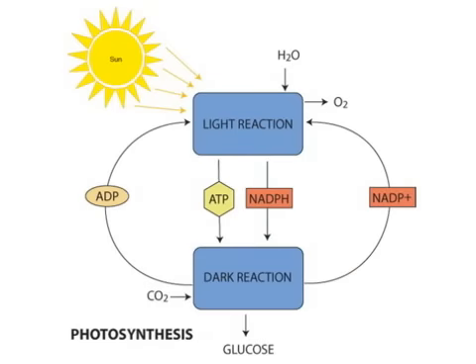Photosynthesis, as you have learned, is a process by which plants use light energy to convert inorganic carbon in the form of carbon dioxide to organic carbon in the form of sugars. There are four main pigments that we are concerned with for this experiment.